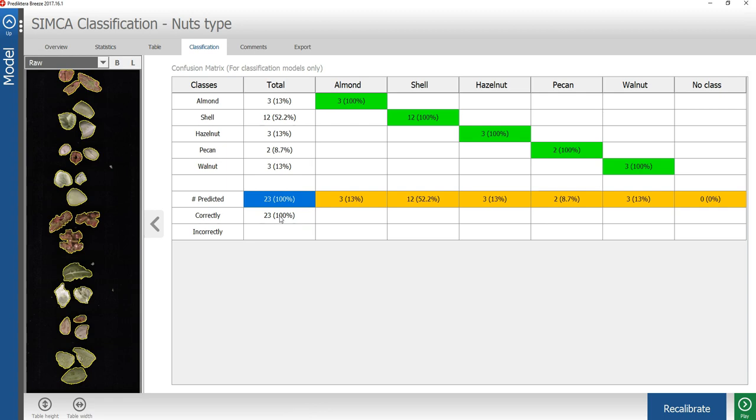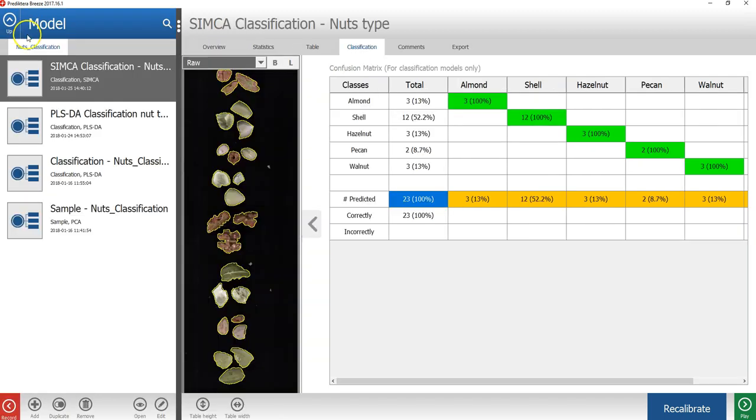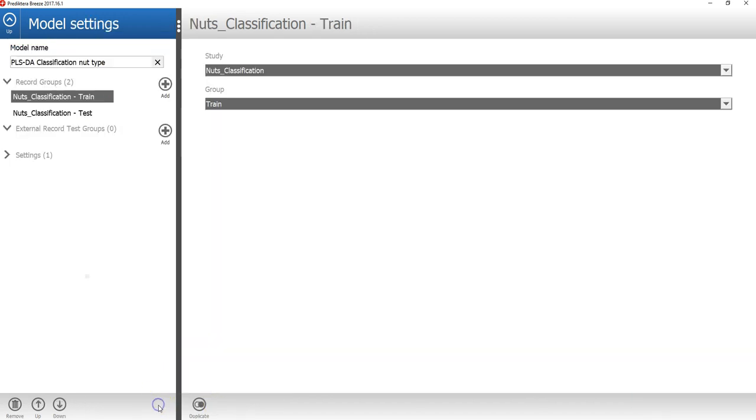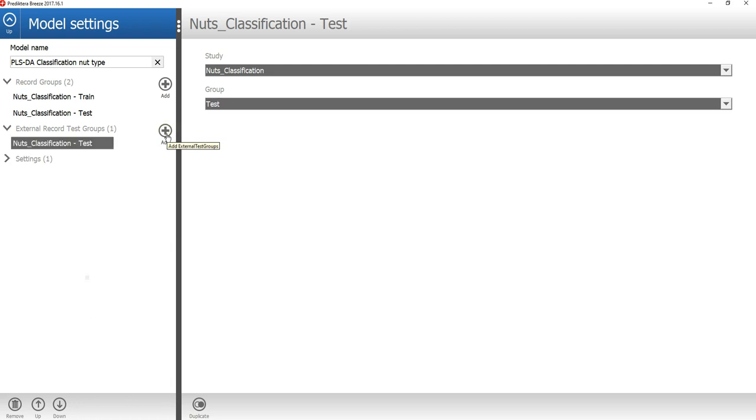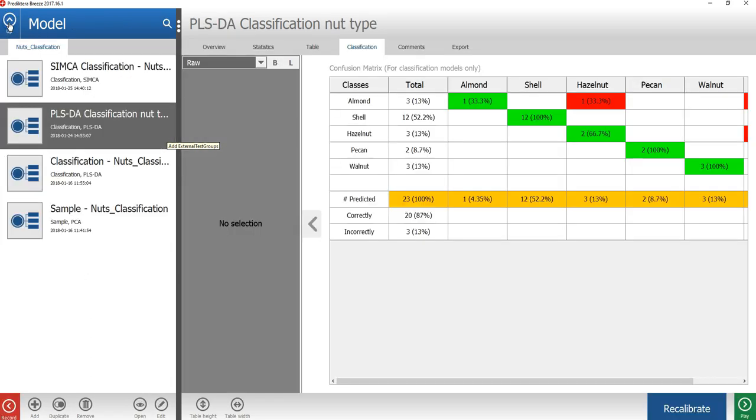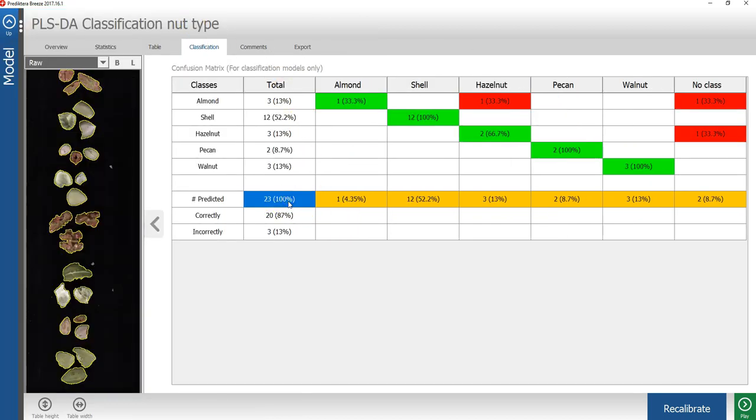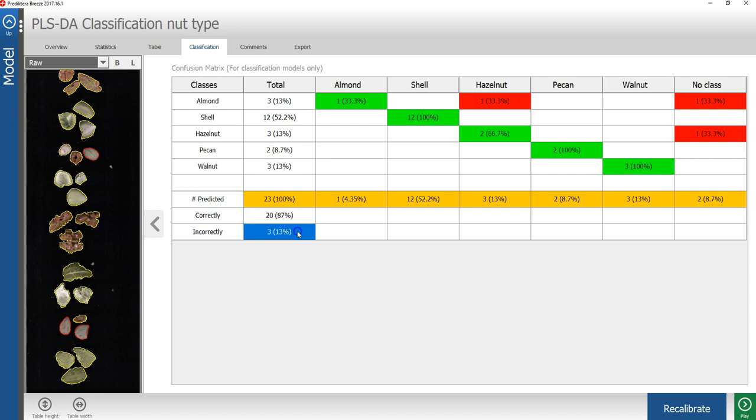Let's see how well the PLSDA model performs for the same test image. Click on the PLSDA model, go to edit, and then press add on external record test group. We can see here that of the 23 samples in the test group, 20 were correctly classified. And 3 were incorrectly classified. So in this case, it seems like the Simca method was slightly better.